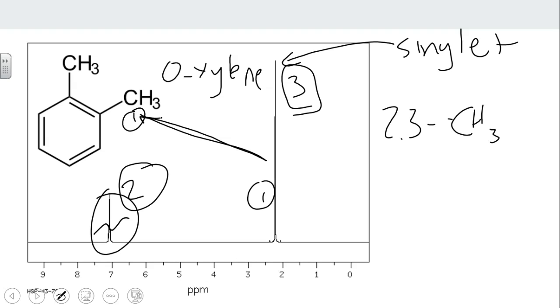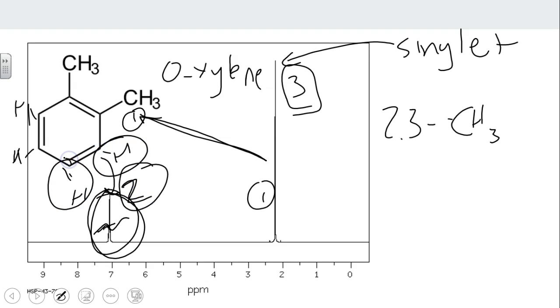And then the next thing would be this peak in the NMR, which is down here in the aromatic region. You'll notice we have 4 aromatic hydrogens on this molecule. There are some hydrogens that are next to carbons with hydrogens on them, so this has weird coupling, but aromatics sometimes have weird coupling stuff with them. So what I would suggest is that this peak is the aromatic hydrogens, and that this represents both aromatic hydrogens that are in a unique environment here.